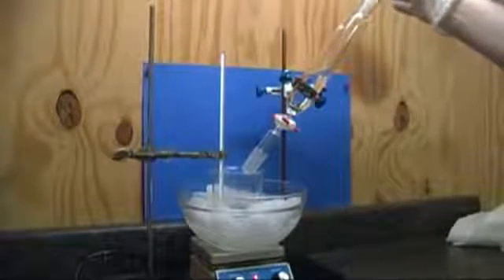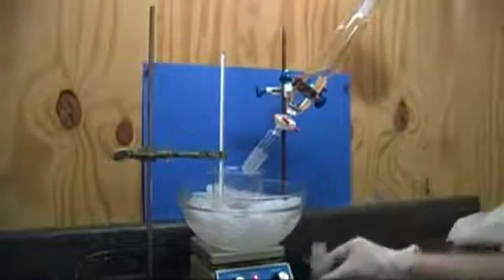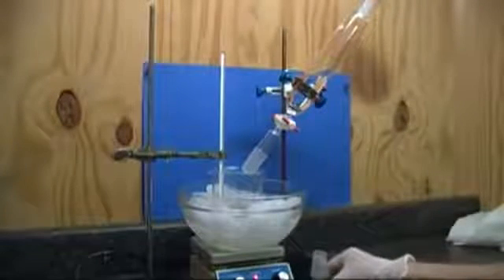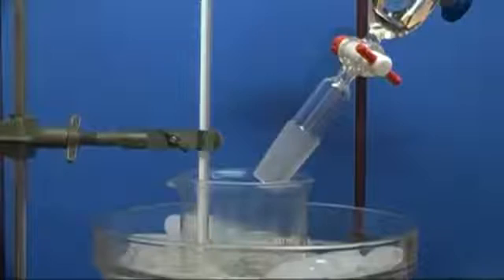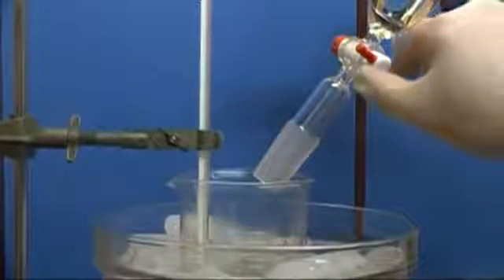Also add a thermometer to keep track of the temp. We do not want the temperature to exceed 50 degrees C or we will start to get side reactions that we do not want. I set my drip rate so that the temperature did not go over 40 degrees C.